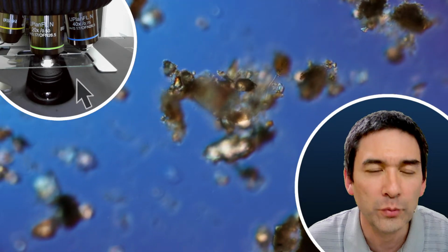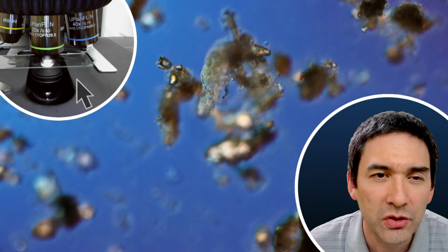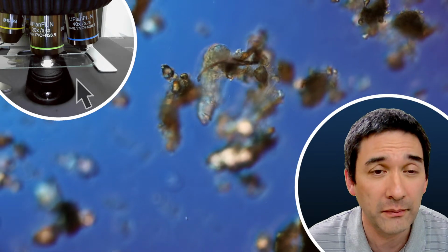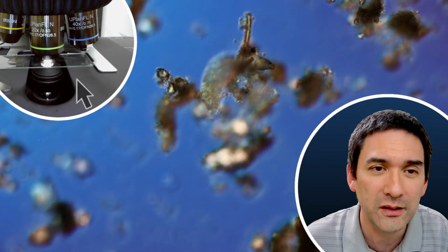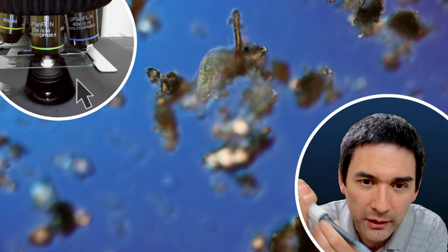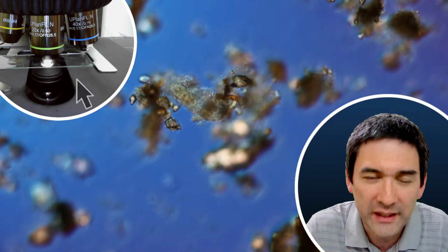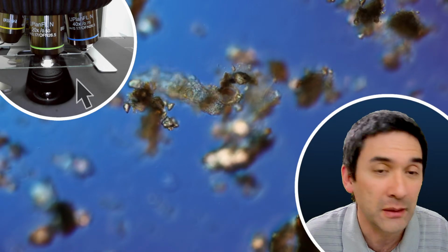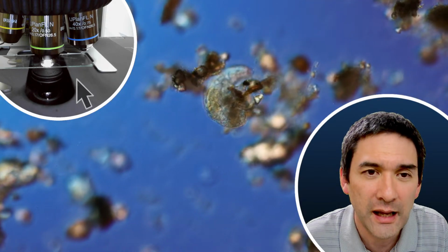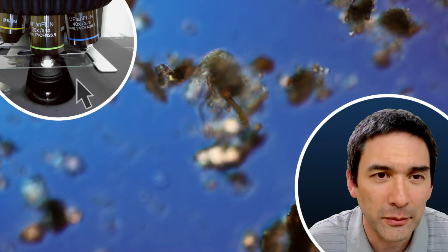Where I really zoomed in a lot, because in the other videos that I made, I took quite a bit of time to isolate the tardigrades. This was a very painstaking and tedious process. I went with a pipette close to the tardigrade, tried to suck it up and transfer it to a different slide, and added fresh water to rinse away the sand. I repeated this several times, and sometimes I even lost the tardigrade in the process. But then I actually got a much nicer video. But this one here is a little bit more the authentic process.